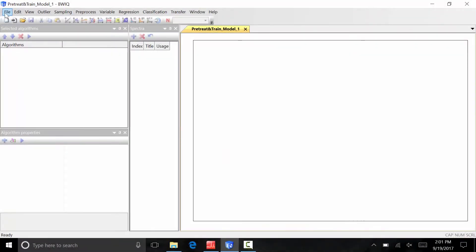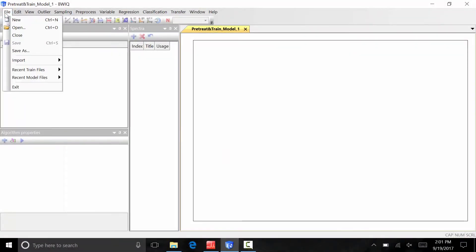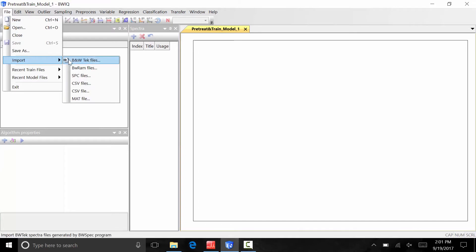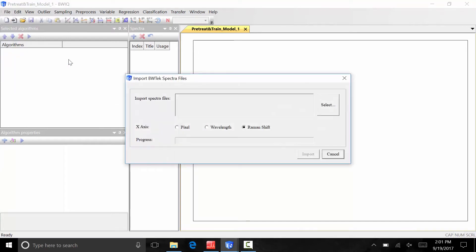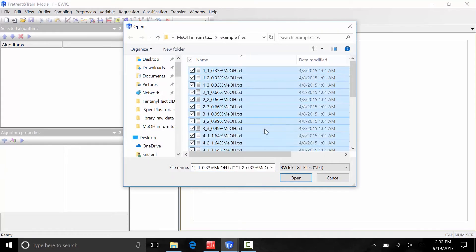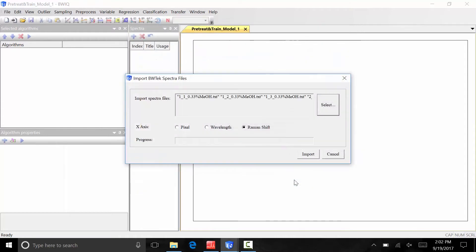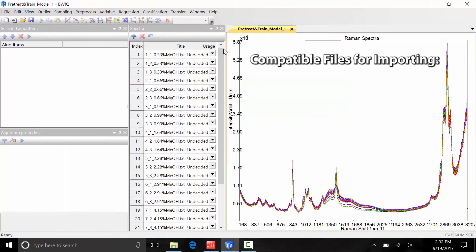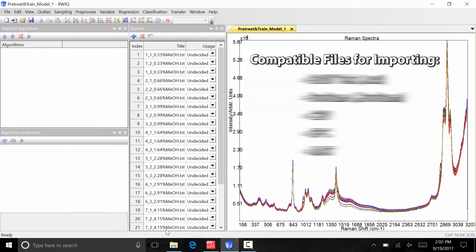Now that we have our data set, we can open the BWIQ software to the pre-treatment and training window. To input spectra files, go to File, Input, and select which type of files you would like to import. Locate the data set and import the files into BWIQ. The data files now appear in the spectra window along with the corresponding spectra.